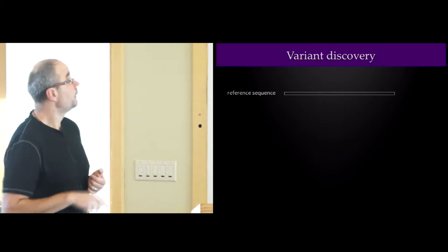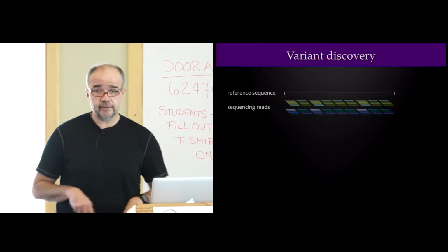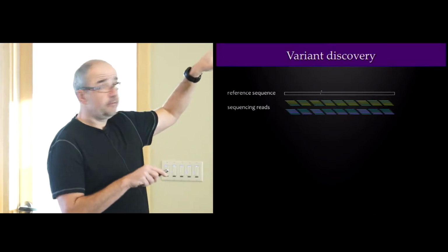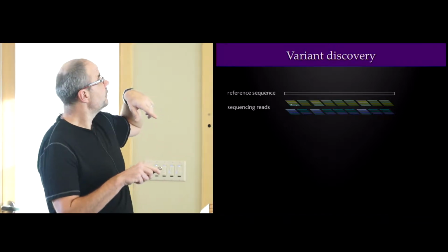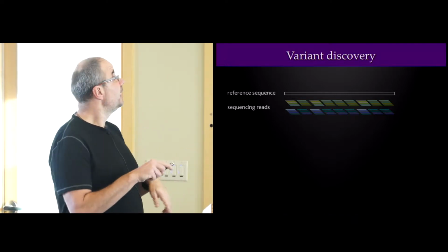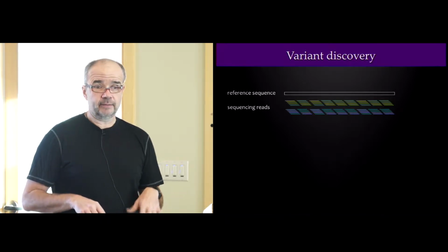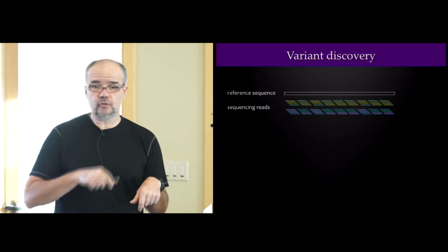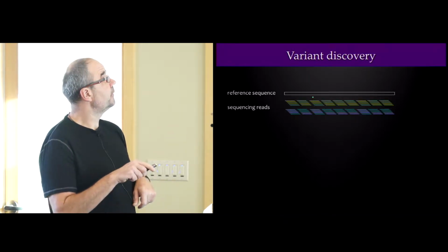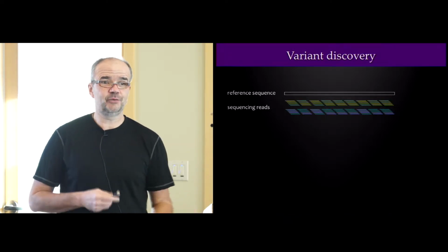So the idea is that once you have a reference genome sequence, then you can use this as a template to organize, for example, sequences from two additional individuals. So if the yellow or greenish are DNA sequences from person A, and blue are sequences from person B, now you can localize these sequences relative to the organismal reference sequence, and with some caveats, you can be certain that when you compare these sequences to these sequences, you will be looking at the same region of the genome in these two individuals.